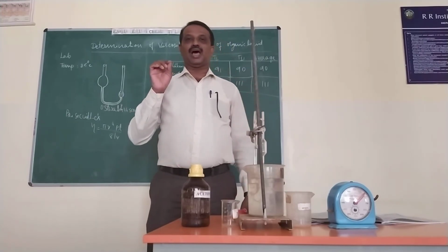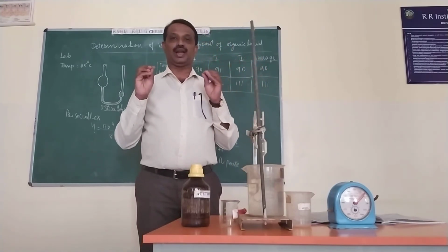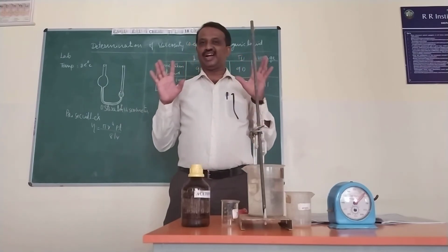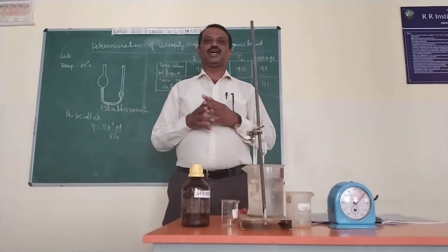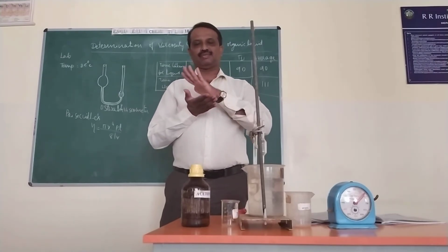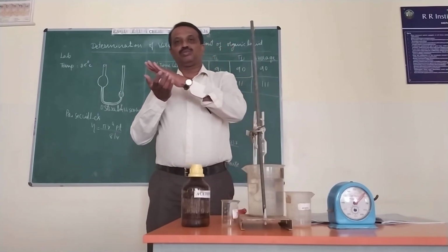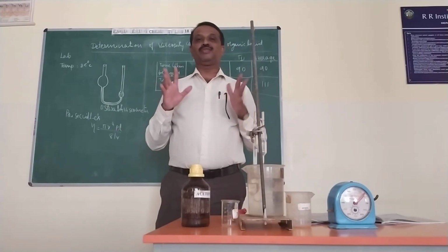Further, we always compare the viscosity coefficient of the given organic liquid with water, so we call it the relative viscosity coefficient. We are going to find the relative viscosity. For that, first we find what viscosity is. We know viscosity is the friction between two layers of liquids. In water it is average, in petrol it is less, and viscosity is more in castor oil, so its movement is very less. So it is inversely proportional.